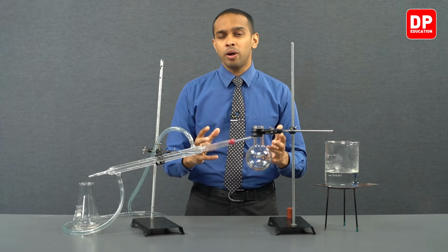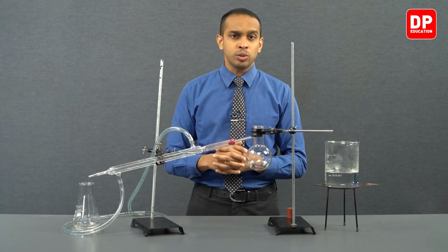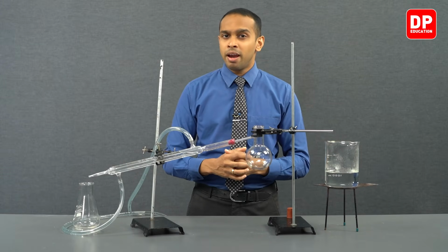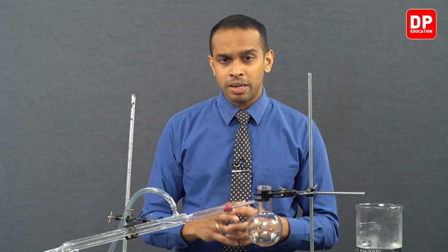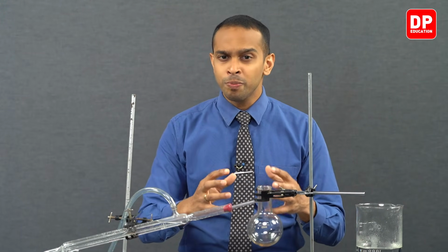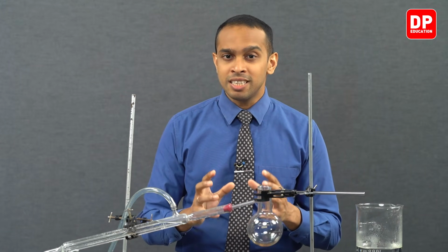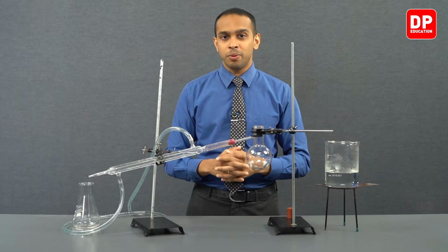Water would usually boil at 100 degrees Celsius, and eugenol would normally boil at 254 degrees Celsius. But this mixture, we saw when we were carrying out this experiment, was boiling at 99 degrees Celsius, below both of their boiling points.